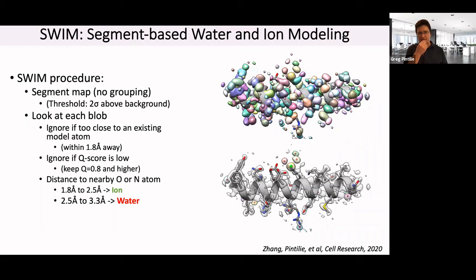But I think it's an interesting question in that I'm not sure it addresses this too well. In this case, for example, there is a part of the side chain in both conformers where the atom position is the same. In that case you would expect that density, because it represents more particles, is still well resolved, still atom-like and not as smeared out. Whereas in the other parts, where the atoms are different in each particle, you see that they're not as well resolved, so you will get a lower Q-score in those areas. That's something to think about. A very interesting question.